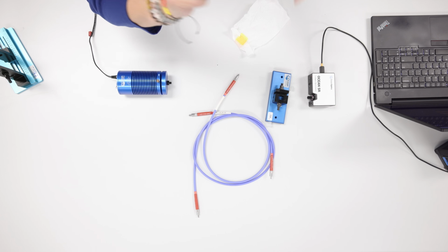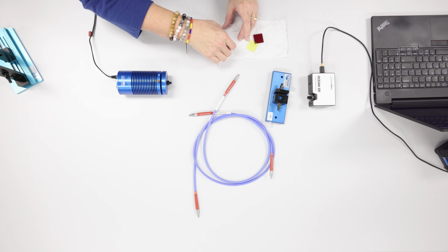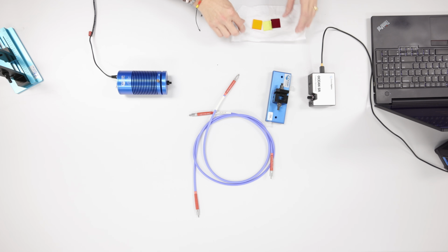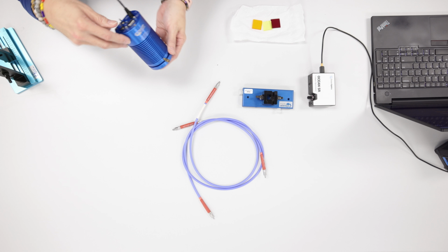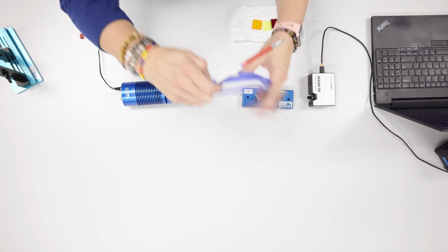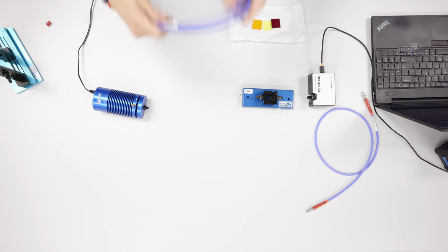We're just going to look at some little filters that I brought, which will have very specific profiles based on what's in the filter, right? The coating. So we're going to look at this in the visible using our HL2000, and I'm using visible and IR fibers. I'm just going to connect this up.